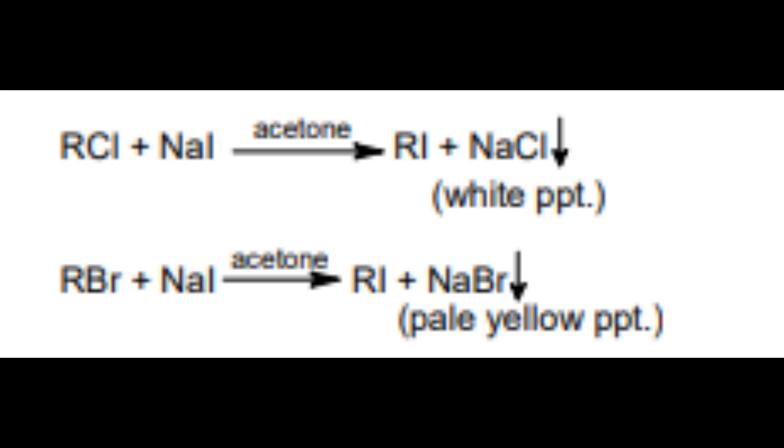1.4.6 Preparation of derivatives. According to the functional groups identified in Step 5 in Sec 1.3 above, the crystalline derivatives for each of the identified compounds are prepared and their melting points are compared with the melting point of the known compound derivative given in the literature. This will lead to the confirmation of the identified compound. Normally, 1 or 2 derivatives are prepared which are simple and could be easily prepared in good yield. The derivative is purified by crystallization and its melting point is compared with literature melting point.